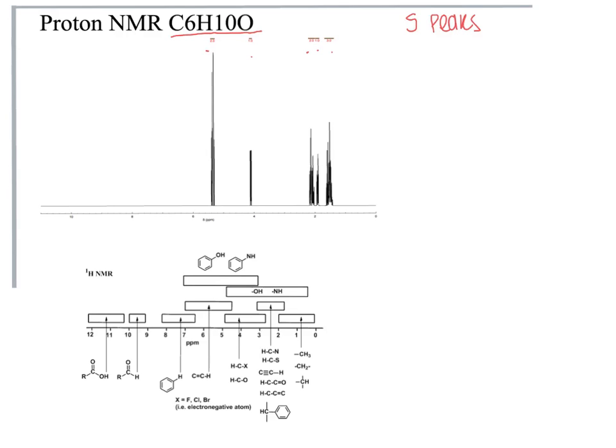And now by comparing the peaks and how they are arranged and analyzing their chemical shifts, we can see how this first peak that we see here falls into around 5.2, 5.3, indicating the presence of a double bond between carbon and carbon. So we can circle this one.